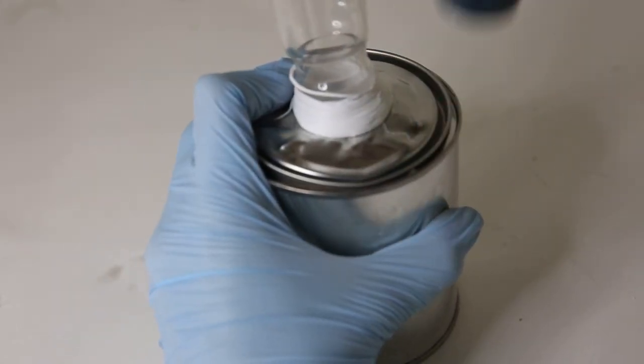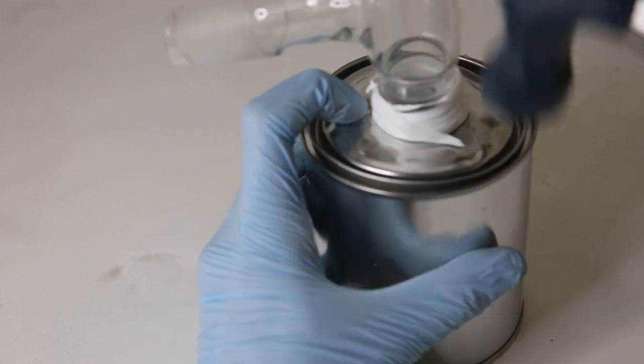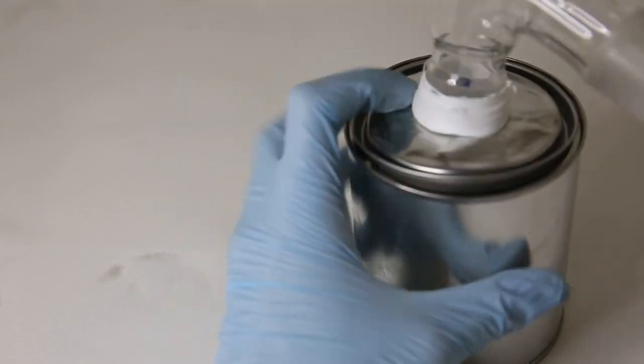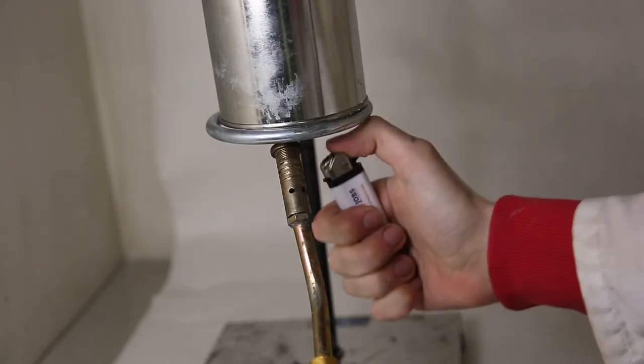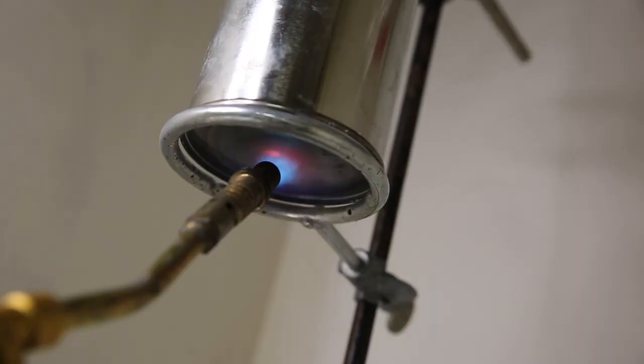After I got most of the powder in I cleaned off the powder that got into the sides, put the lid on top and shut it with a hammer. So now that the vessel is complete I simply attach it to a condenser and start heating the underside with a torch.